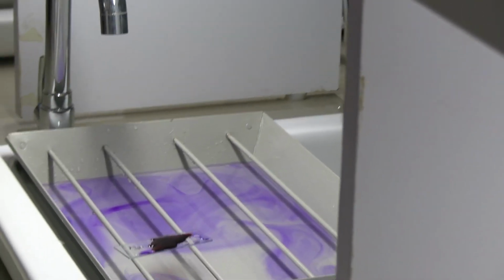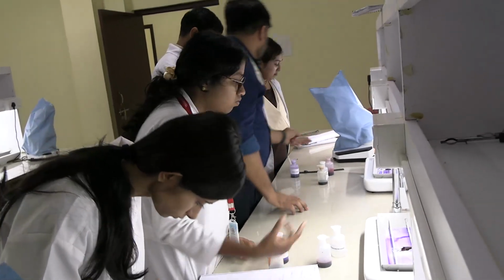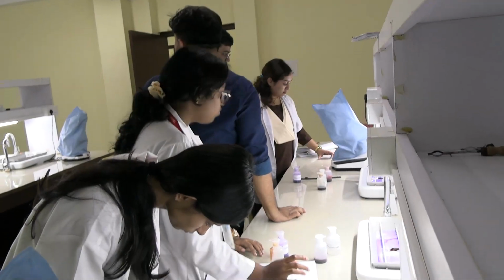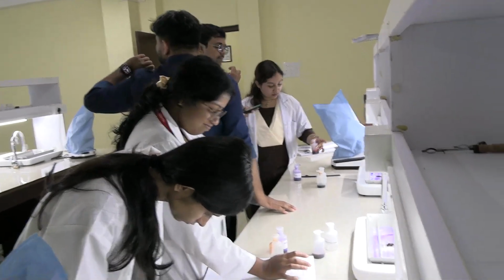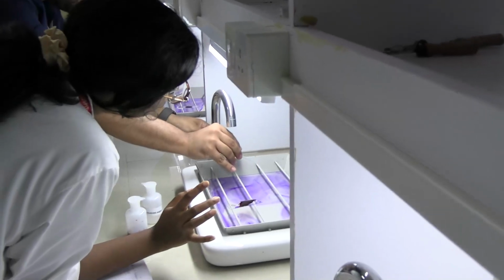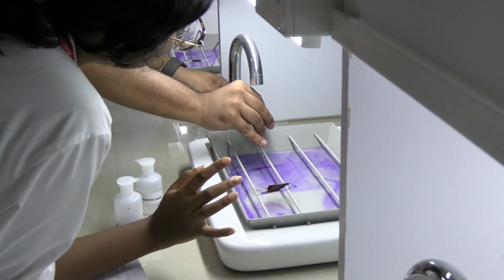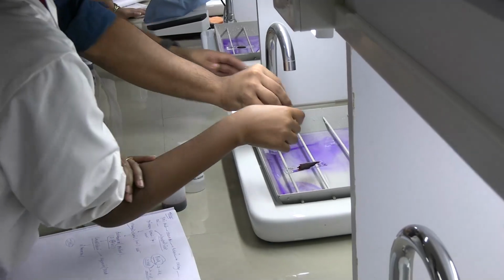What is the third step? You are doing this thing wrong, okay? What you have to do? Do we have an extra smear? Dr. Nakshatra, do we have an extra smear right there? This is how you do it, okay? Put the water down to your fingers like this.